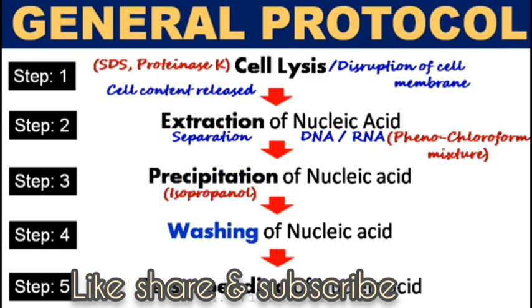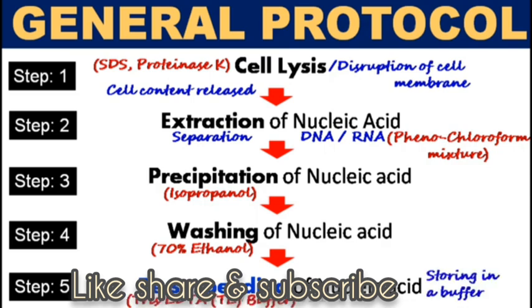The fourth step is washing. To ensure the purity and quality of the nucleic acid, the precipitated nucleic acid is washed once or twice with the 70% ethanol. Then the final step, resuspending. In this, the washed and precipitated nucleic acid is resuspended in TE buffer, a buffer for storage purpose, until further use.